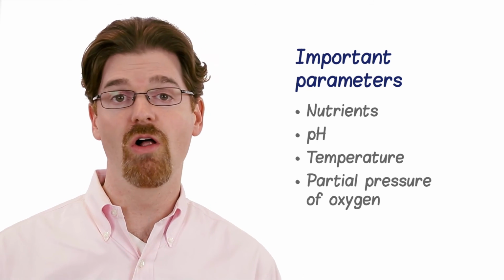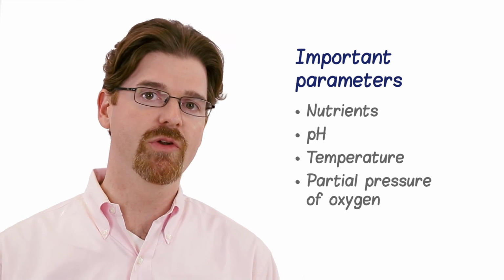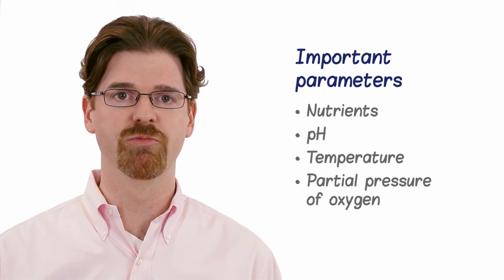In many cases, all of these parameters are, by themselves, important to the cells, but the interrelationships between them and their combined effects can be complex, making the job of designing a cultivation process just that much more challenging. In the next segment, we will review the metabolic pathways that allow cells to survive and reproduce while making our biologic medicine. We will then consider how the bioreactor can provide a physical system to facilitate these essential processes.